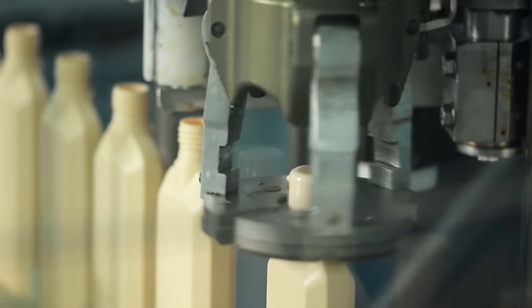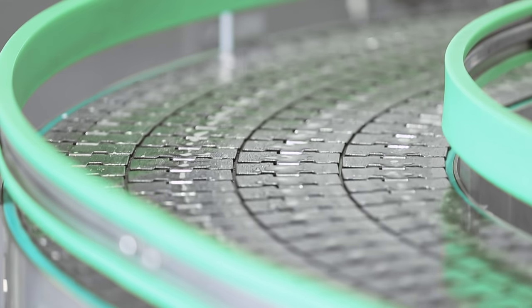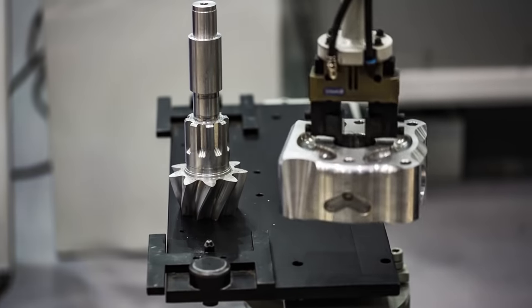The answer is simple: by measuring density. Density measurement is a simple and cost-effective way to monitor quality and ensure that raw materials and finished products meet specifications.